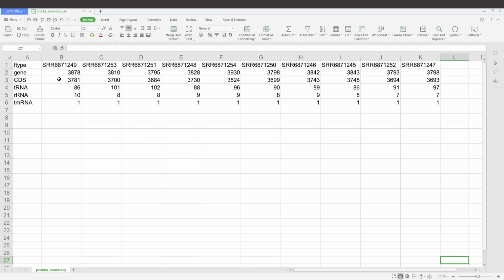So if you have this, you can check the GFF or GenBank files and then visualize them as well. You can use tools like JBrowse. You can use tools like Artemis to visualize them. Those are things you can also do. You can also use Circos to do some visualizations. I've covered one such tutorial and I'm going to cover more. So after getting this, you take a look at the sample that you want to follow or explore further, and then perform some downstream analysis.